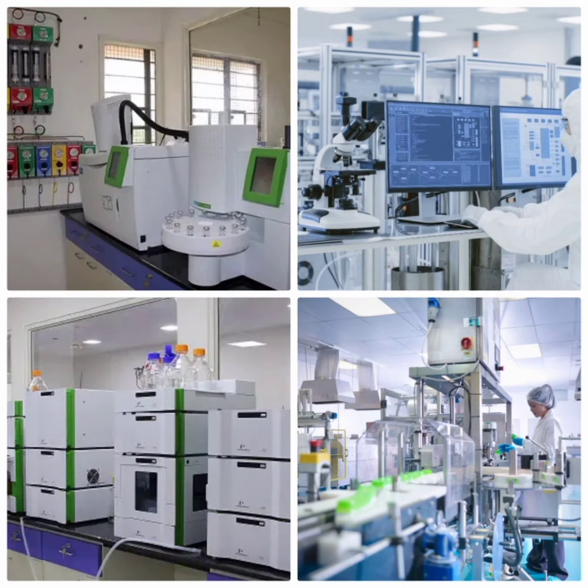The more comparable the partitioning equilibrium is, the higher the chance of having co-elution. If this happens, you may not be able to see where one peak ends and the other peak starts, so the resolution would be poor.